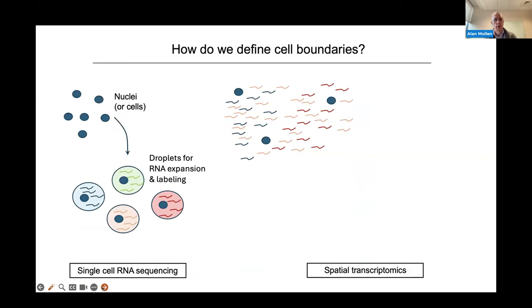So we could then at least feel more confident that we were able to see staining of the RNA transcripts once we got rid of that fluorescence.